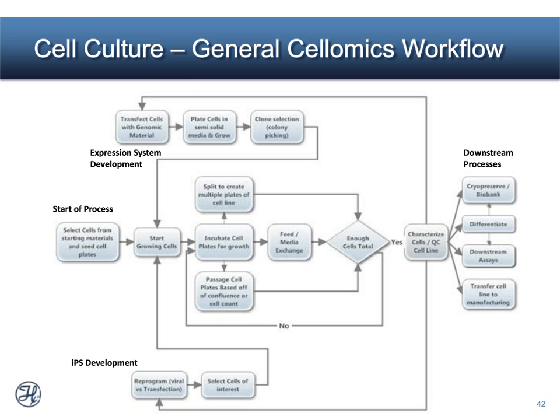Another example would be for IPS development on an automated system. Once you expand your cells, you may want to reprogram them and also passage those and expand the reprogrammed cells that you're interested in and feed those back into a cell maintenance and passaging system.